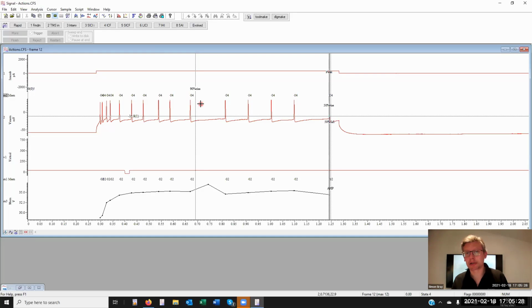For EMG, it's another slight technique change. And again, for the voltage clamp type data, once again, slight differences. But all of these analysis techniques are available for all of the waveform windows that we have. So even producing a waveform average and then asking cursors to find max, min, threshold crossings, etc., is possible.